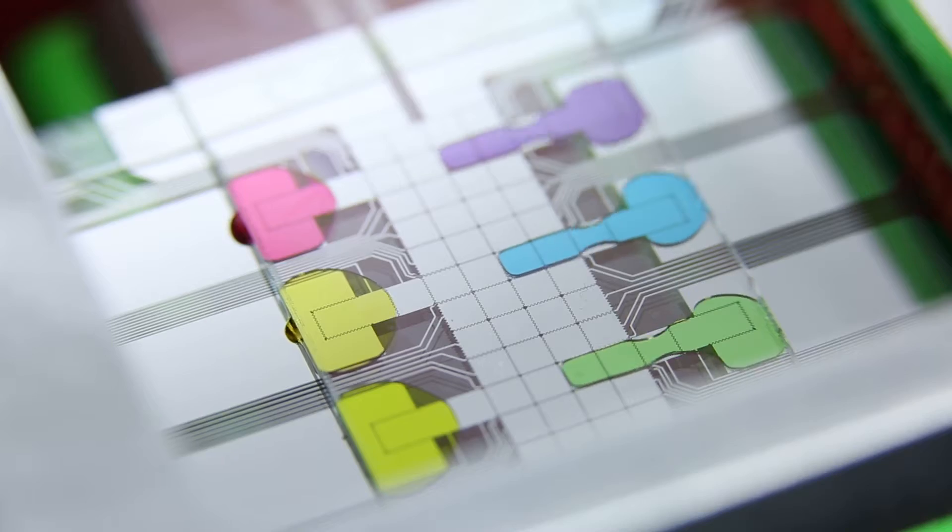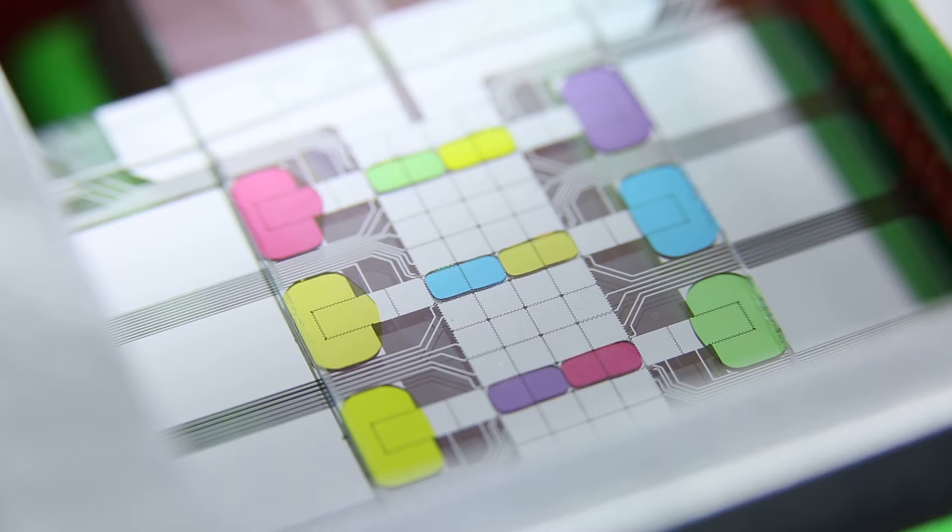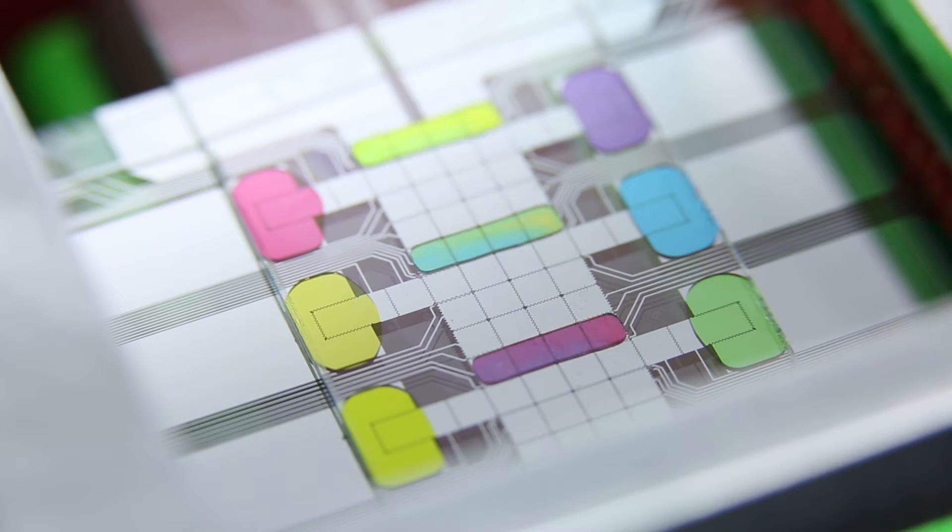In our lab we use a particularly unique method that we call digital microfluidics. In digital microfluidics, droplets are manipulated by applying electrostatic forces to an array of electrodes.